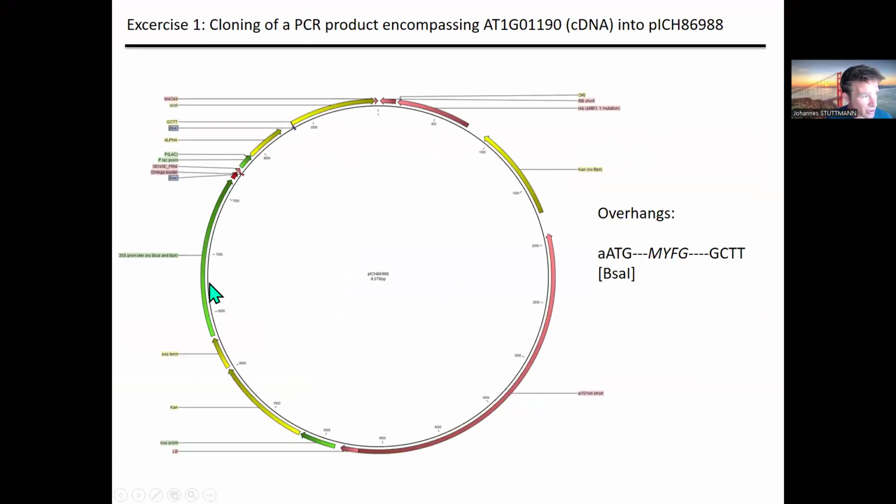And as already discussed before, I basically only use Golden Gate cloning and only use this hierarchical DNA assembly, which decomposes sequences into functional units, and then these functional units can be reassembled into genes. So let's say I want to change a promoter, then I just use a different promoter in an assembly, and I will get a different construct in the very end, driving a different expression level.